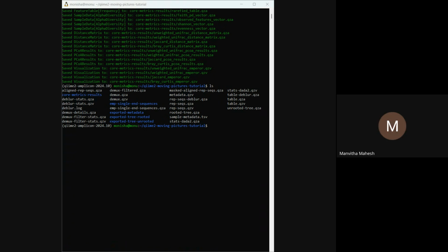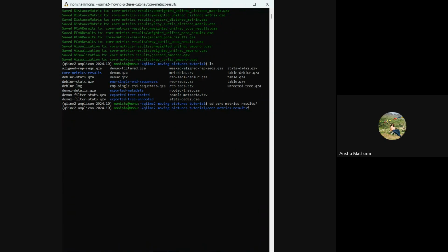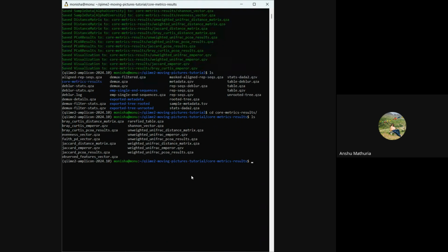Yes, ma'am. List. See, you can see we got so many files here.